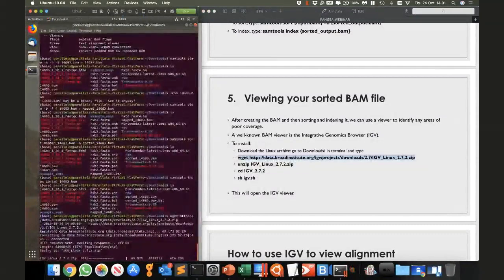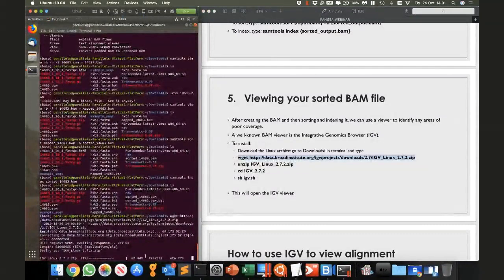But anyway, once you've downloaded that file, it's still coming. Wait for it to finish. Quite cool. It gives you a little ETA, how many seconds it's going to take. So you can go make a cup of tea if it's going to take more than 5 minutes or something like that. Almost there.